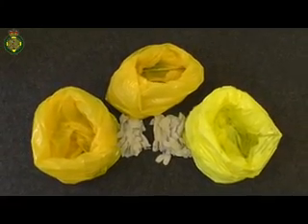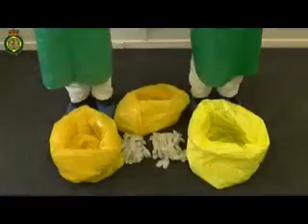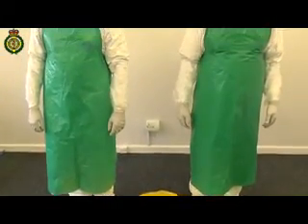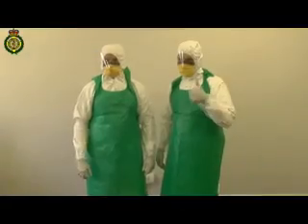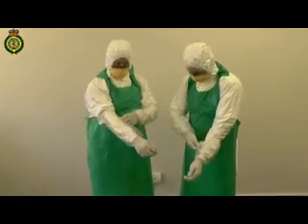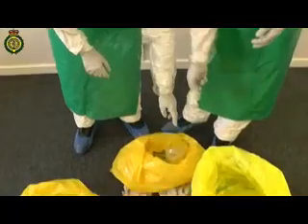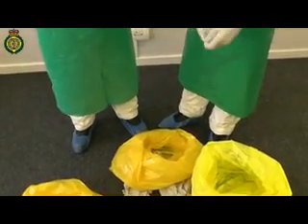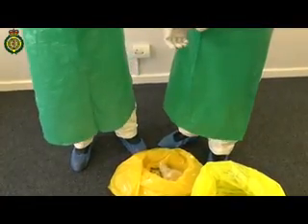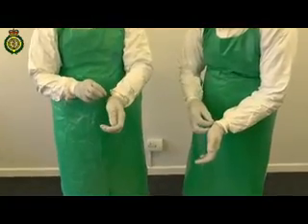Remove an ample stock of gloves for each member of staff of the correct size from their boxes and place in the middle for easy reach. The officer then needs to stand back and follow the relevant action card for disrobing. This begins with a welfare check. First, remove the sleeve protectors and outer gloves and place in the center clinical waste bag. Put on a clean second pair of gloves.